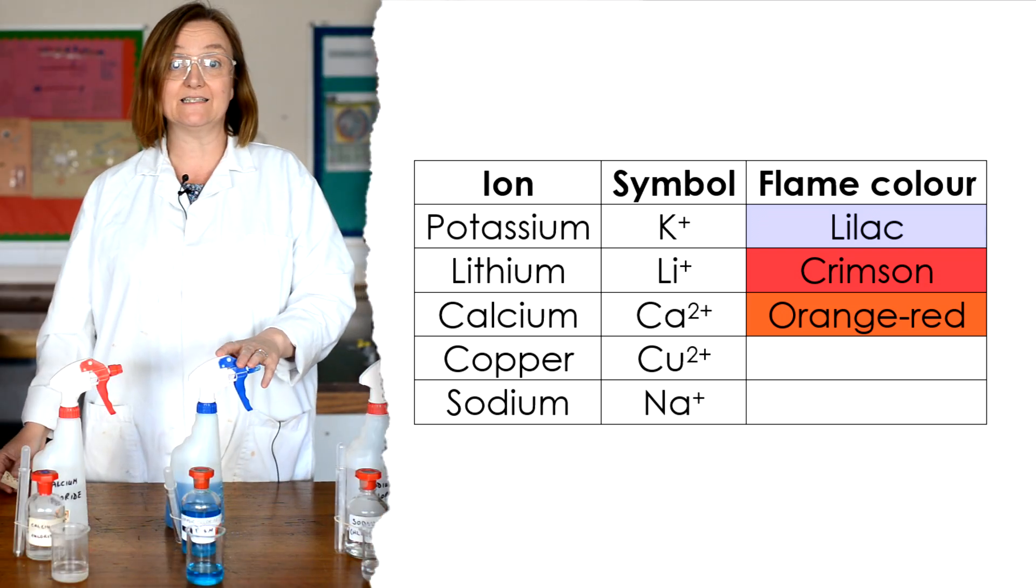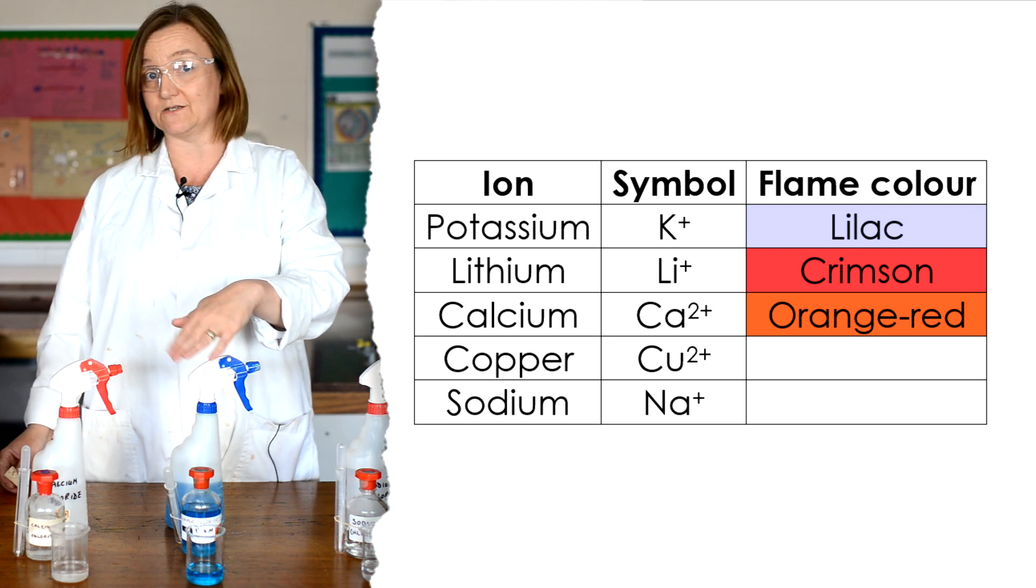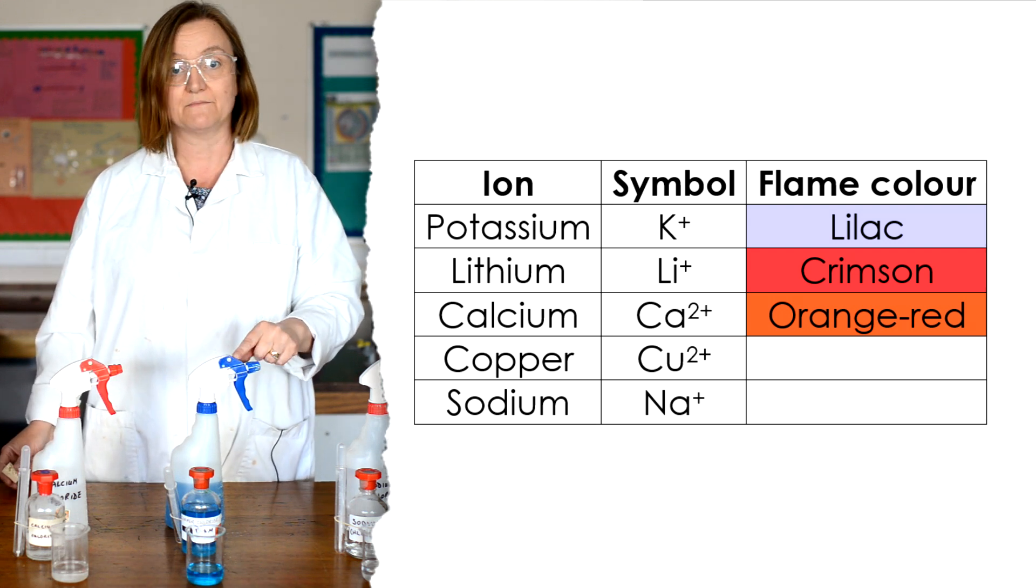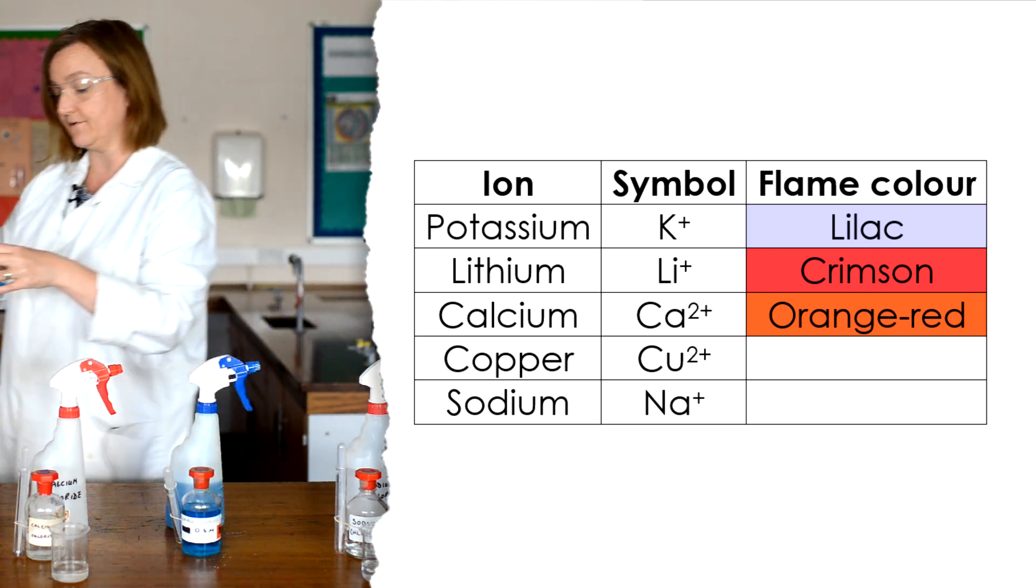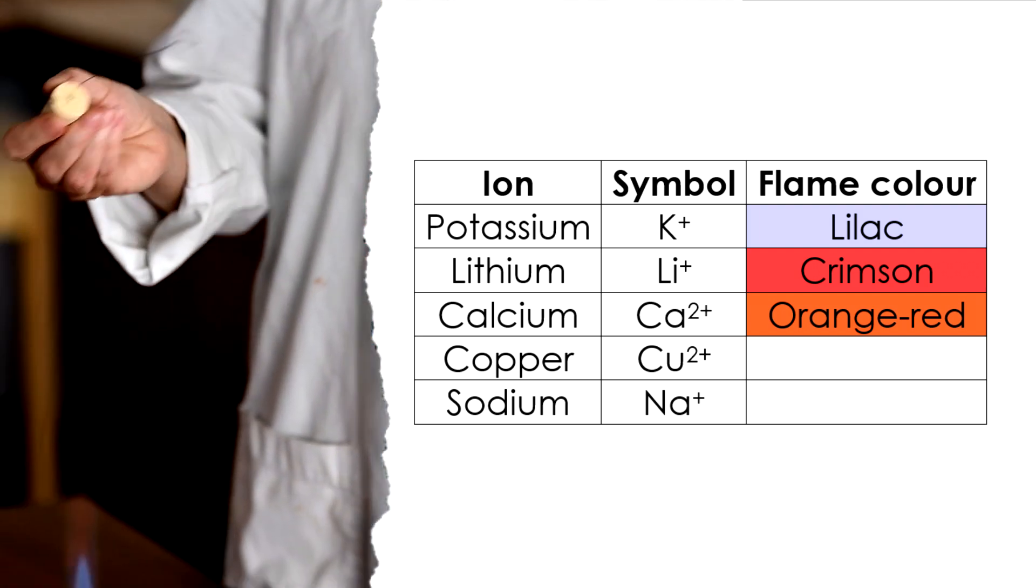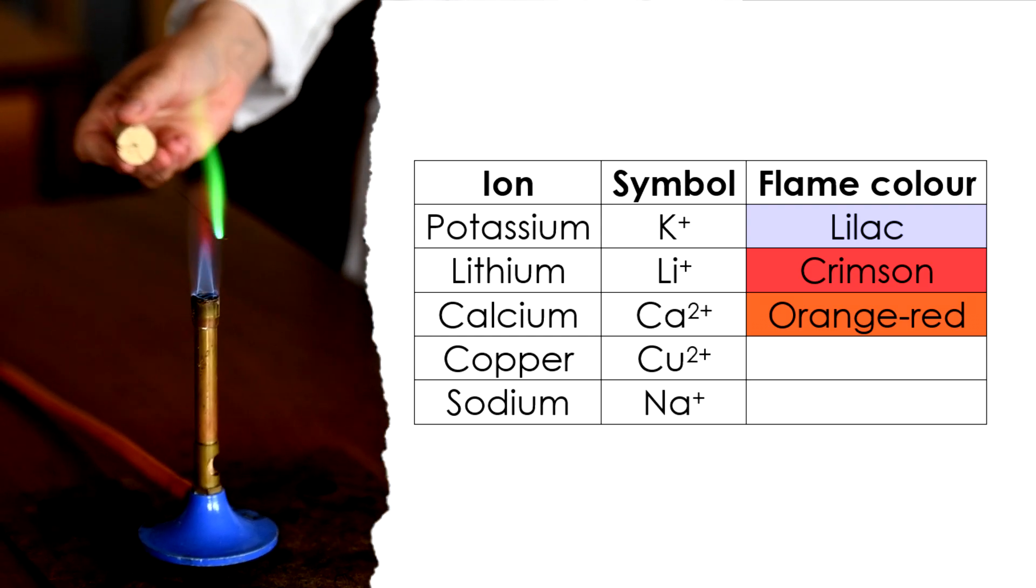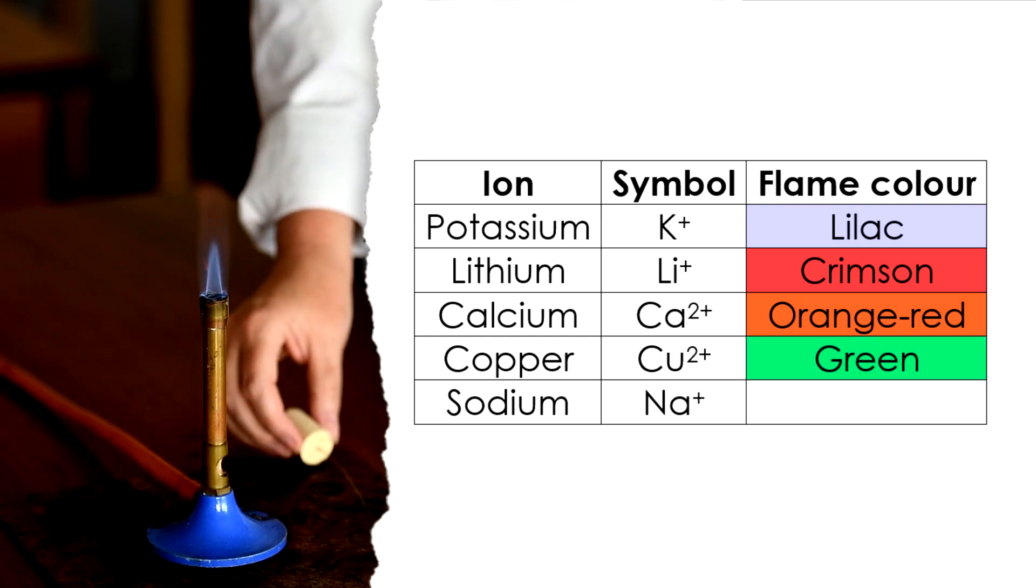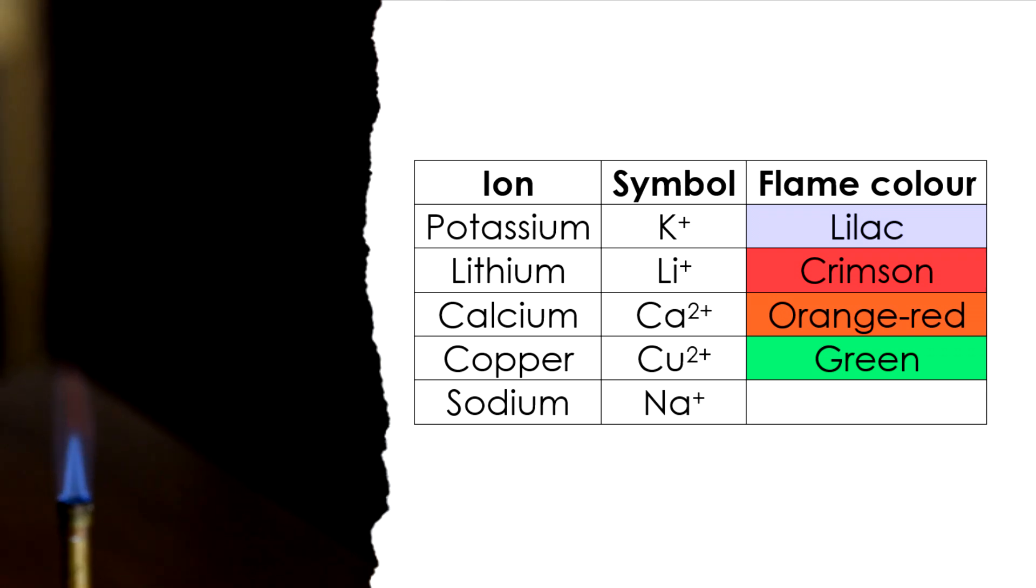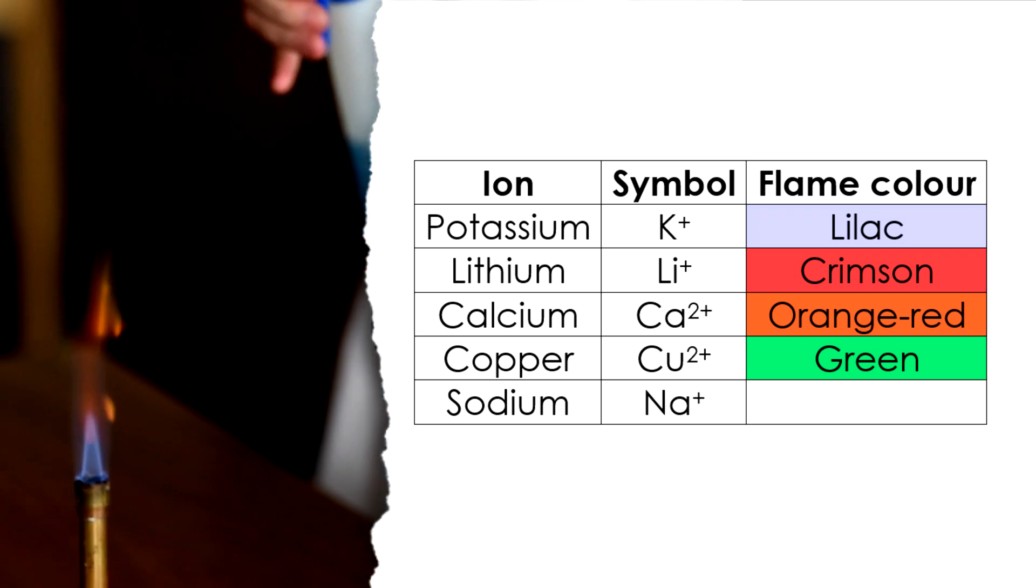Now onto the instantly recognisable copper chloride, because its bright blue colour and solution always gives it away, but it also gives a really good flame colour. So nichrome wire at the ready, and into the edge of the flame. I think that one's my favourite. Really clear, beautiful green colour. So let's see how the spray goes for the copper. Again, very distinctly green.